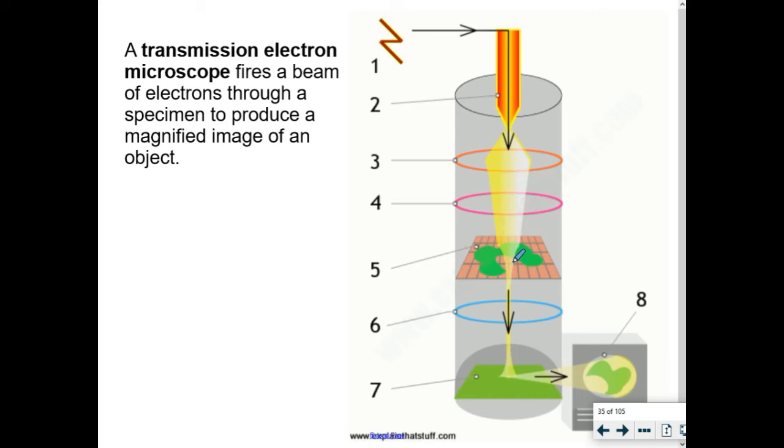That's basically what happens with these electrons. You shoot electrons at the sample, and if the electrons go through and hit this screen at the background, well, if the electrons didn't make it through, then you basically have the shadow. And if the electrons did make it through, then you get the open section. You see how it's basically about whether objects make it through or not.